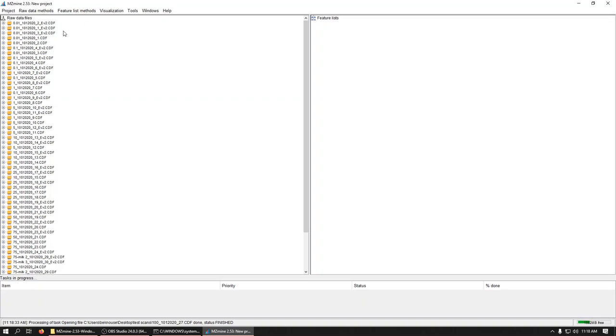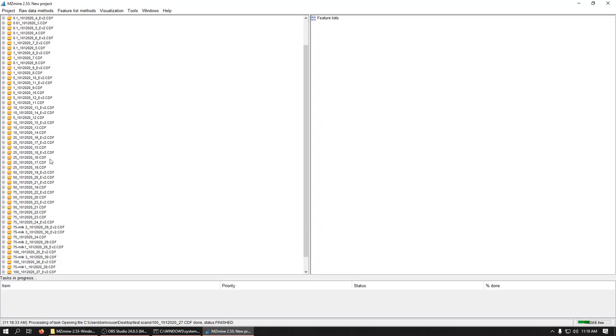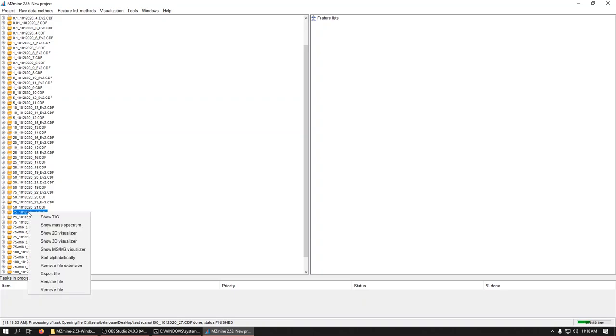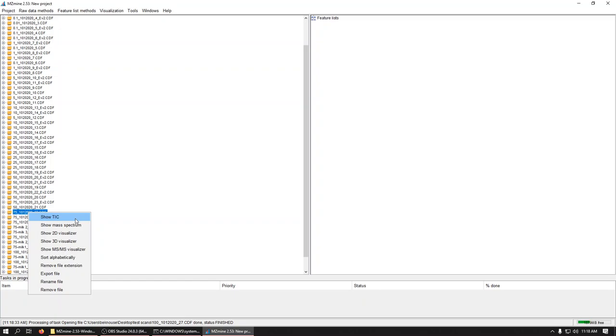Okay, I want to take a look at the two types here. I'll choose a high concentration. Here's our 75 parts per billion standard. If we right click on a file that we imported and we say show TIC.